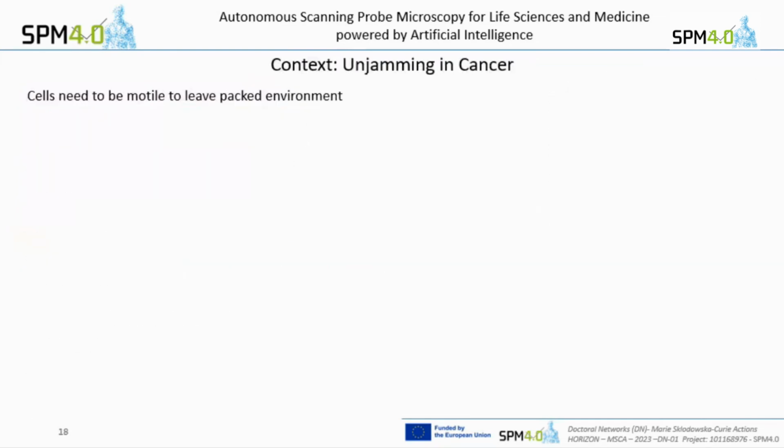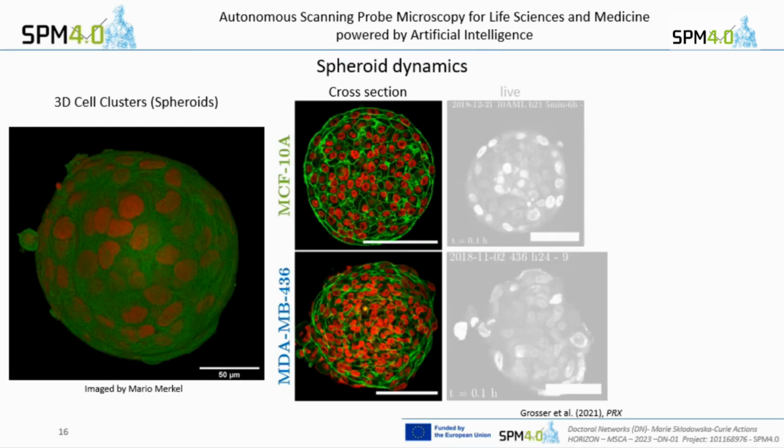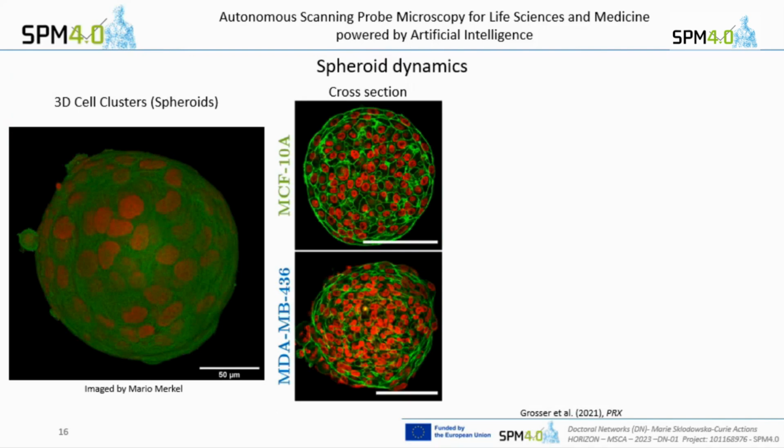When you see the image, it becomes very clear. You have a collective boundary structure, which is usually much brighter than the other green you see there.